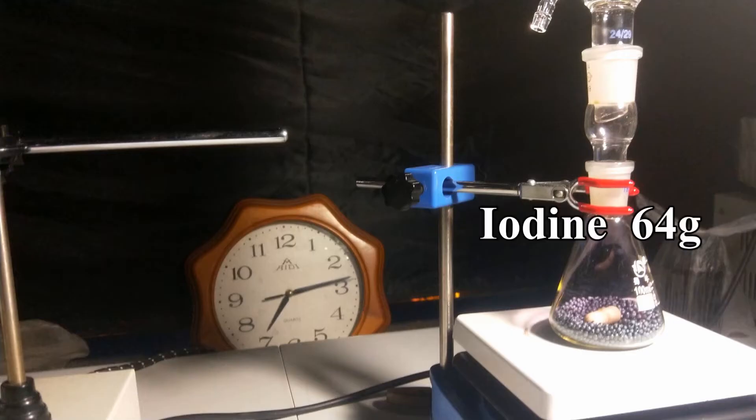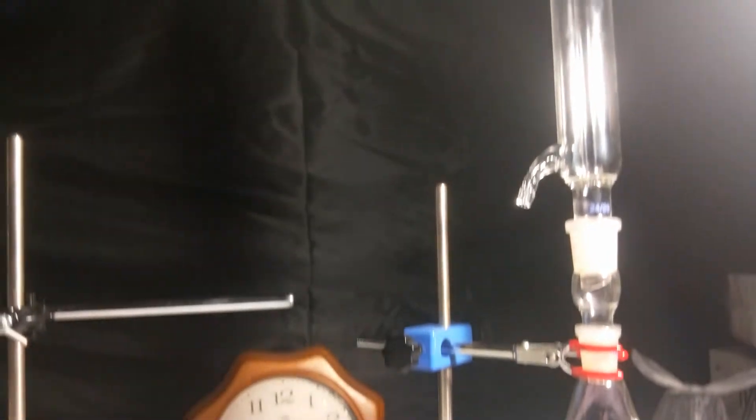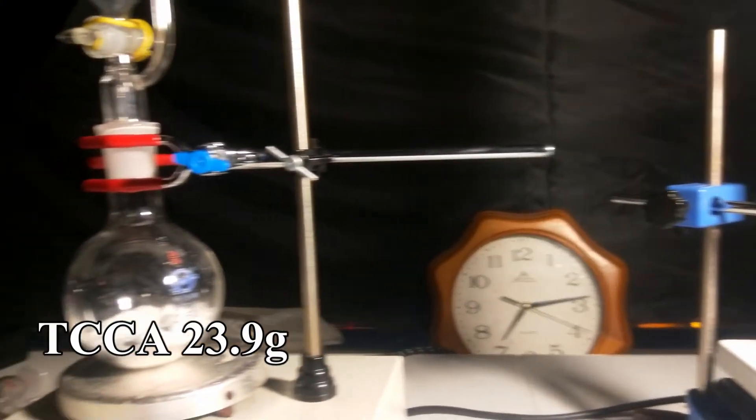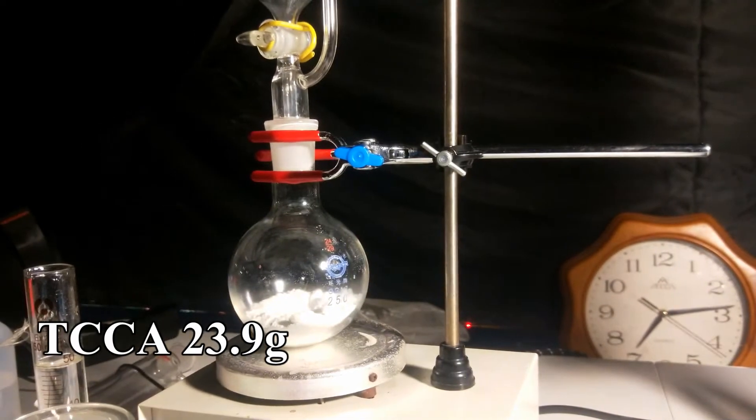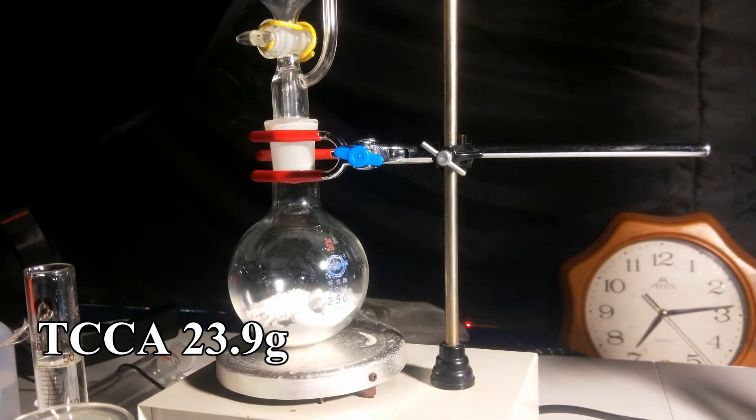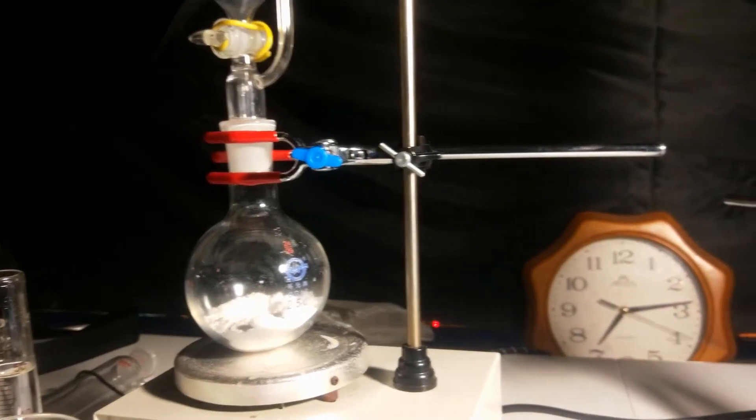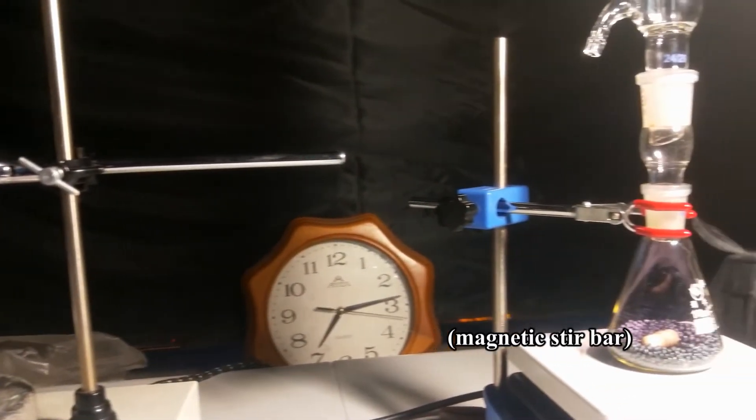64 grams of iodine was placed in a 100 ml conical flask with a condenser placed on the top. 23.9 grams of TCCA was placed in a 250 ml flask as the chlorine generator, connected with a pressure-equalized additional funnel. Both flasks had magnetic stirring.